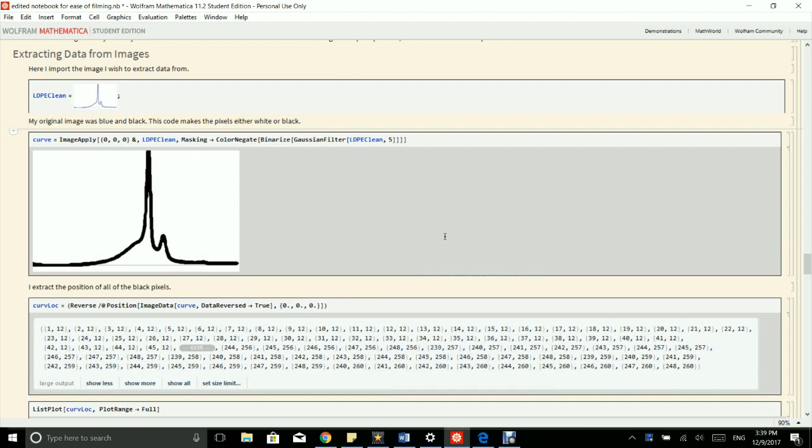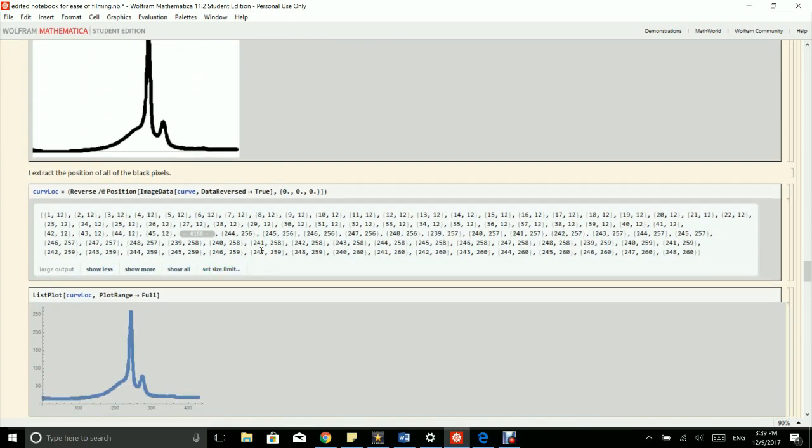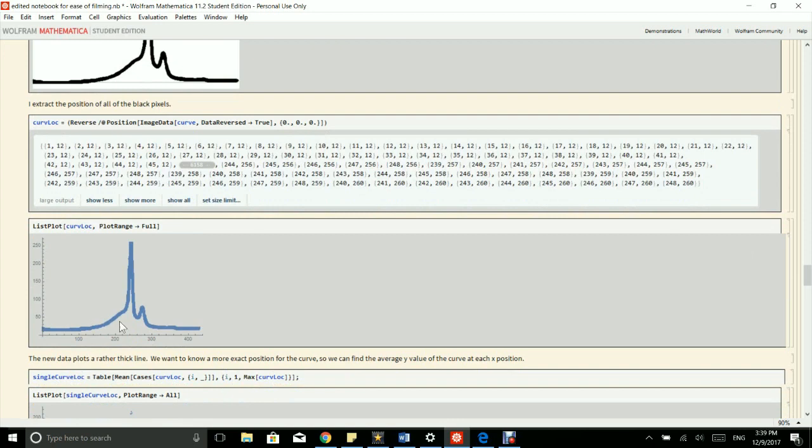One of the challenges with this method is I have to take data that's currently saved as a JPEG image and convert it into something Mathematica can use to find a best fit. So the way I do this is I import my JPEG image here, and then I use that and I convert it to be either black or white.